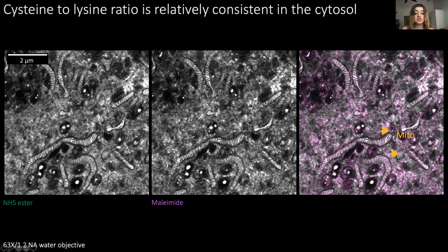This is an open question. We believe that with higher expansion factors, we might discover even more differential pan staining patterns. But I hope in general, I convinced you that through these examples, differential pan staining provides information well beyond the monochromatic electron microscopy-like contrast we can achieve with a single pan stain.